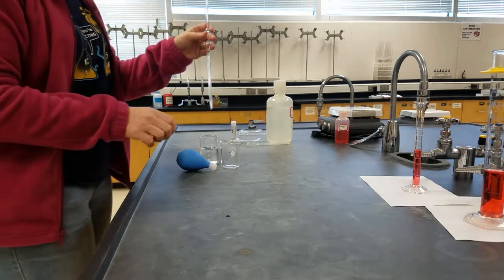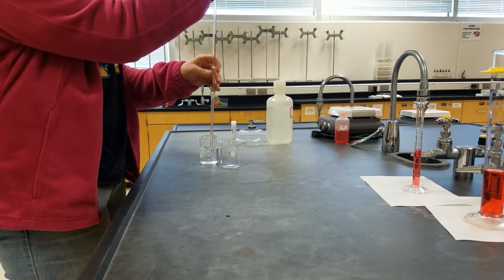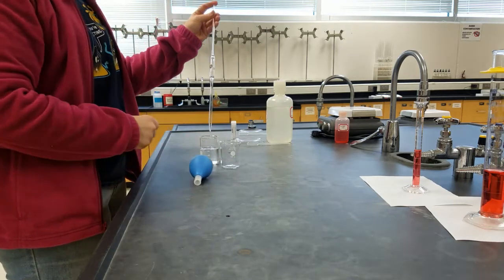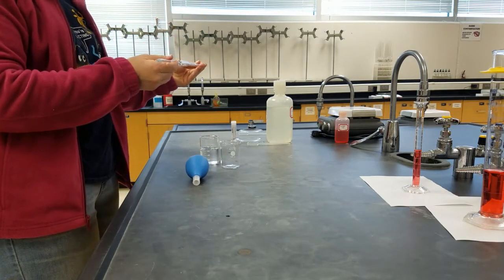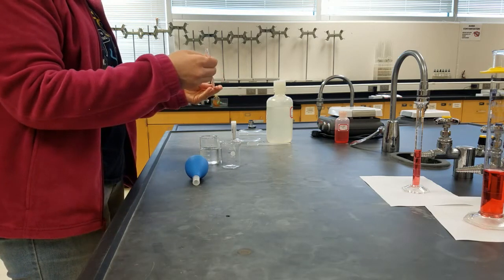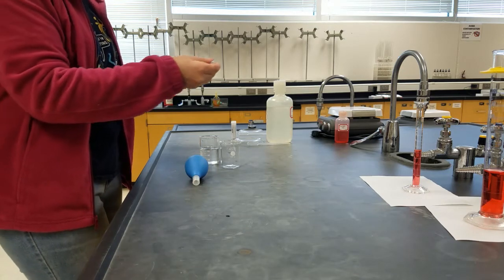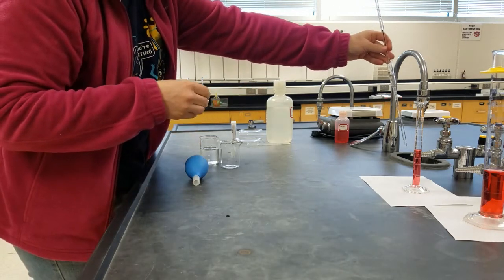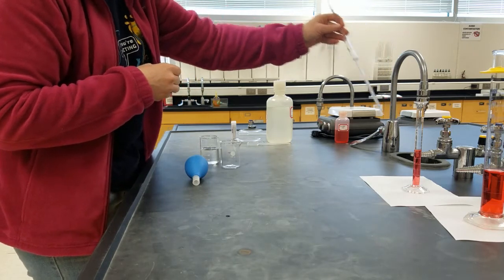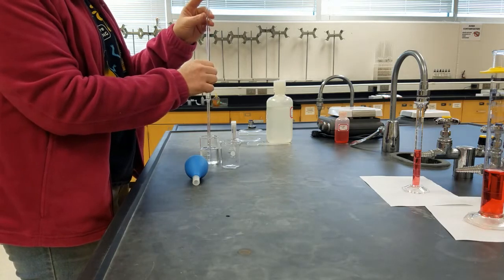To properly pipette, we want to start by cleaning our pipette. So we squeeze the bulb, draw a little bit of liquid that you're going to be pipetting. In this case, it's deionized water. Clean all of the surfaces of your pipette. Because this is water, I'm going to put it down the sink, but if it was other, you would want to put it into the proper waste container. You're going to do that 3 times to make sure your pipette is clean.